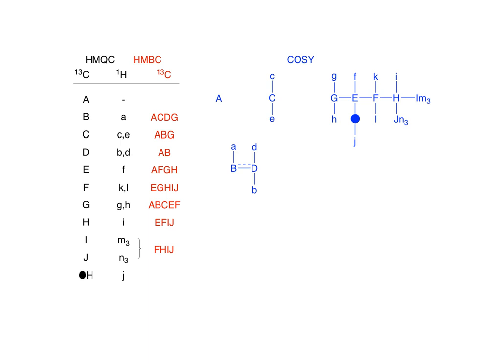The goal is to determine how carbon G is connected with the other fragments, carbon C, carbon A, and carbon B. For that reason, we'll focus primarily on the protons that are near or at these atoms for bond connection.